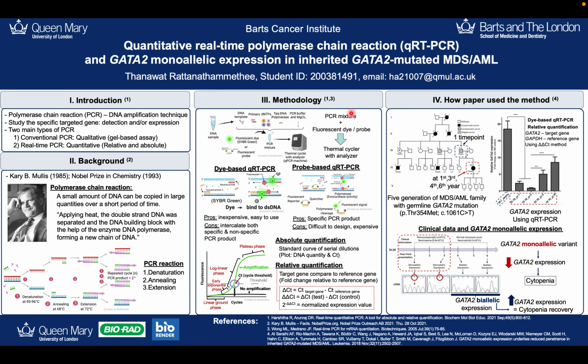Focusing on real-time PCR methods, the first thing is to prepare the PCR mixture. The target DNA or DNA template, along with primer, deoxynucleotide triphosphate as the building block, Taq DNA polymerase, PCR buffer, and magnesium chloride will be the ingredients for the PCR mixture.